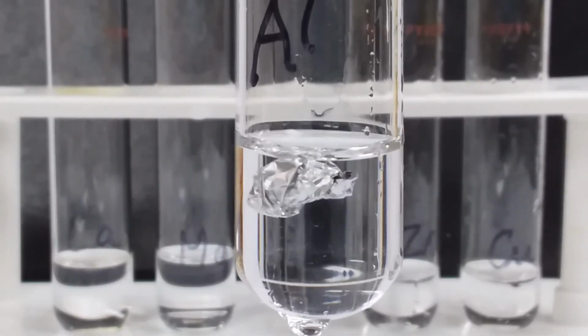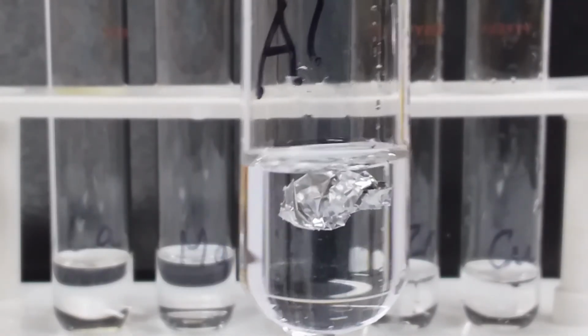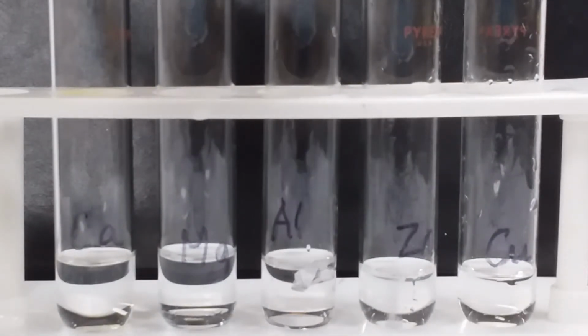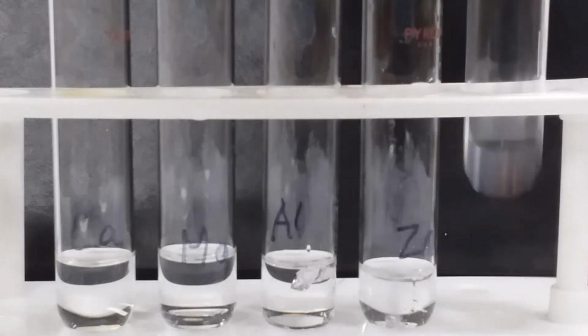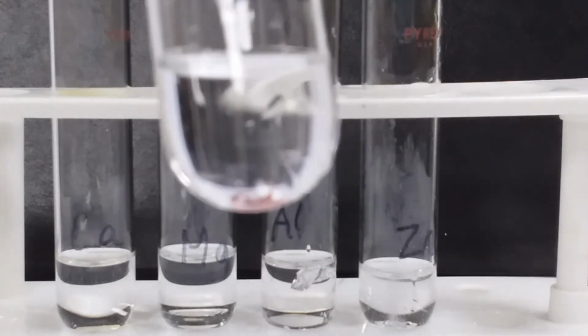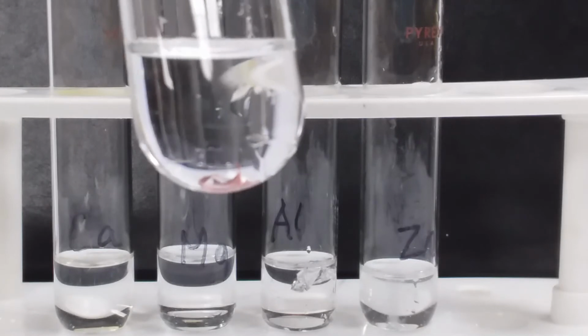Aluminum still has no observable change. Copper, still no observable change.